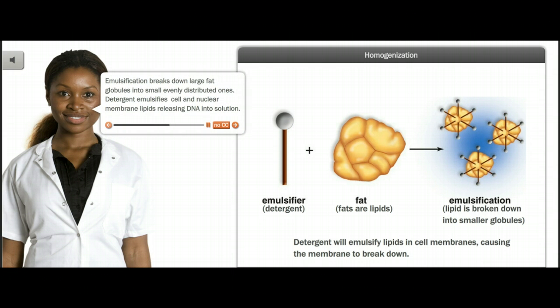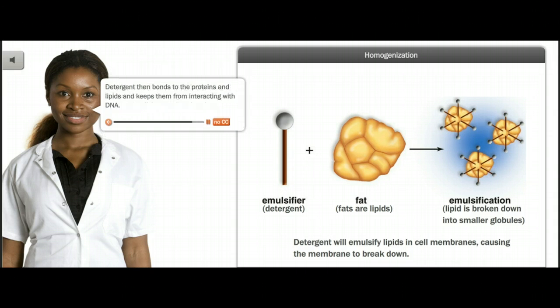Emulsification breaks down large fat globules into small, evenly distributed ones. Detergent emulsifies cell and nuclear membrane lipids, releasing DNA into solution. Detergent then bonds to the proteins and lipids and keeps them from interacting with DNA.